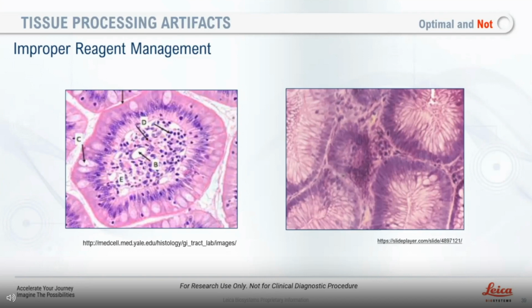So that's why, during our maintenance in the clean cycle, we do the warm water flushes, and that's to keep those salts out of the instrument, right? It's more to keep it, number one, out of the tissue, but also to keep the instrument clean of those salts. I know that at the end of a clean cycle with some instrumentation, it's automatically there. It usually goes through a clearant, a dehydrant, and then a water step, if you have those types of instruments set up like that. So it depends on how often you're using the instrument, and it depends on your maintenance schedule.